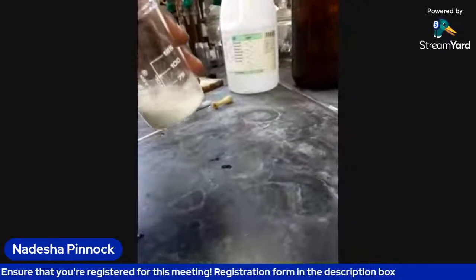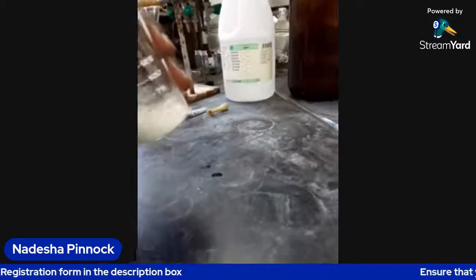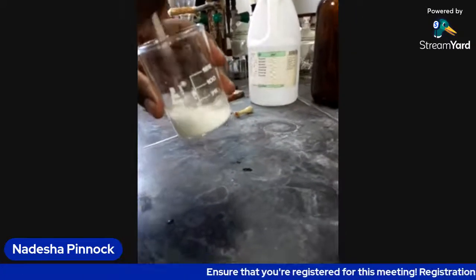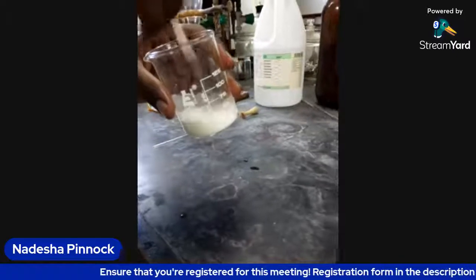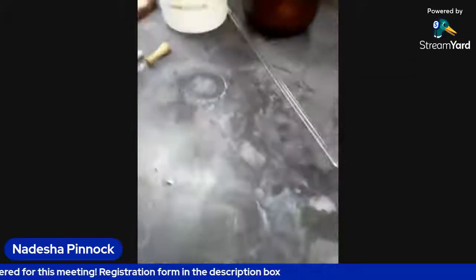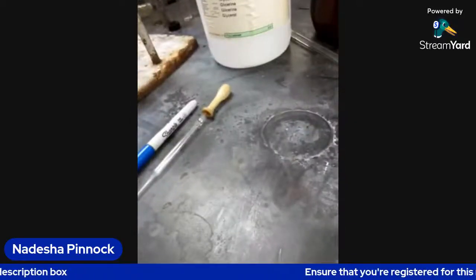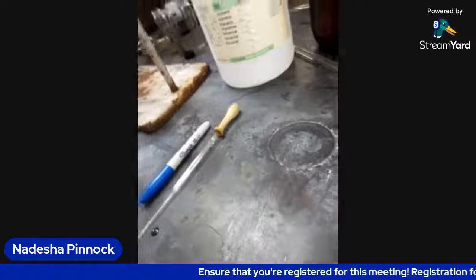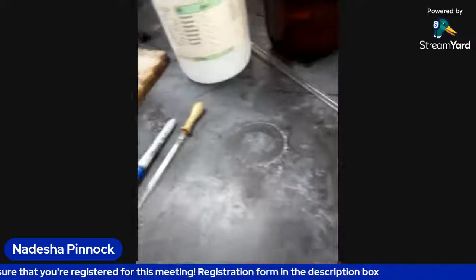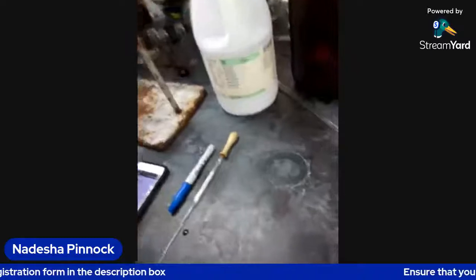Almost like mixing last really. You mix until you get all the lumps out of it. You get a nice, even, homogeneous suspension. Yeah? That looks just about there. After this, we're going to add 5 mils of glycerin and continue mixing. And then we're going to add 5 mils of acetic acid and mix.